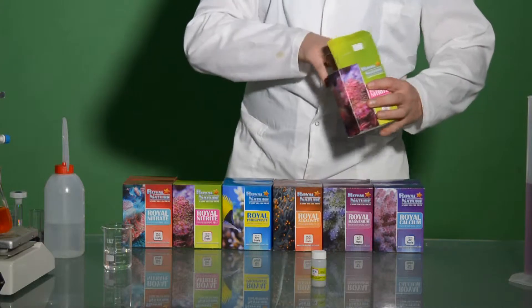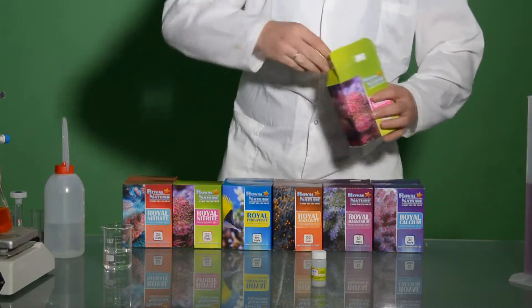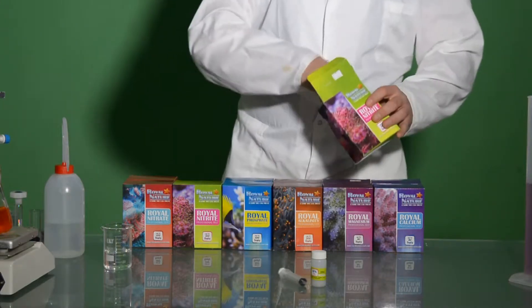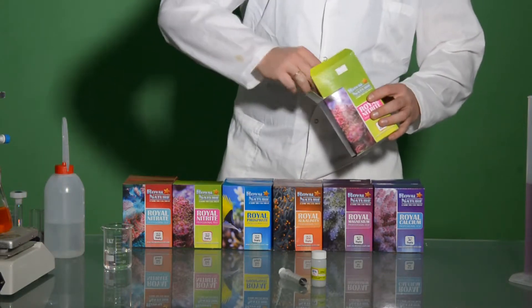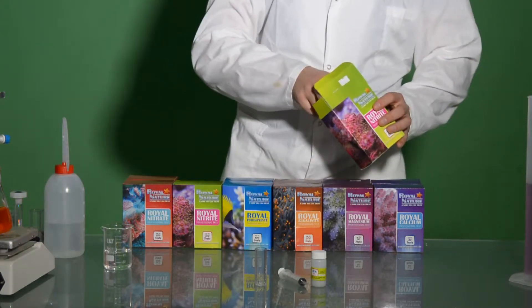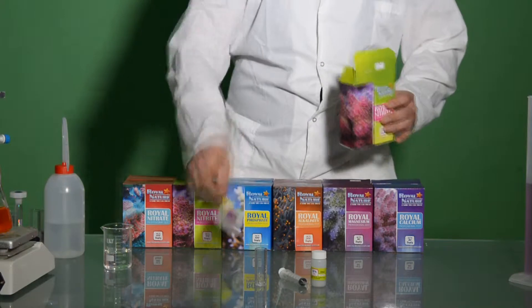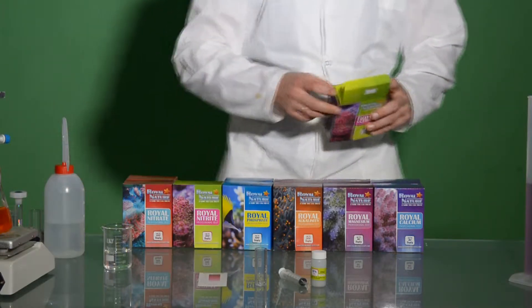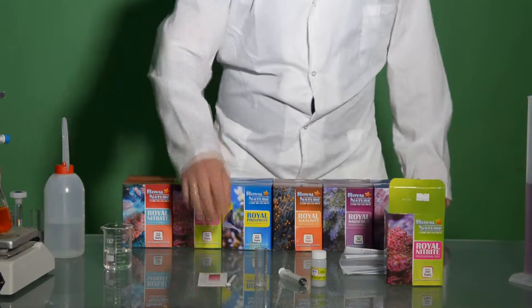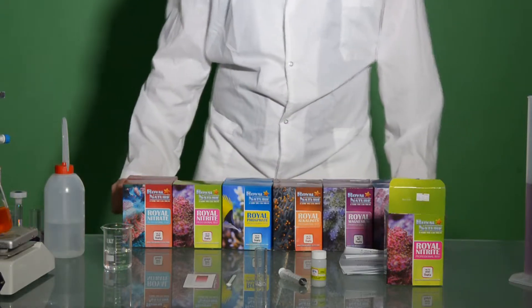We have a bottle of powder marked as NO2, a 5ml syringe, test vial, color chart, and the measuring spoon.